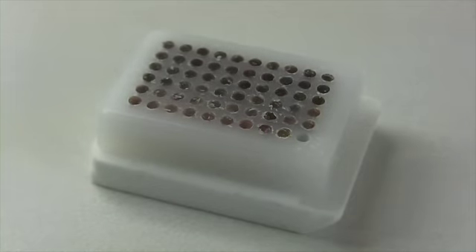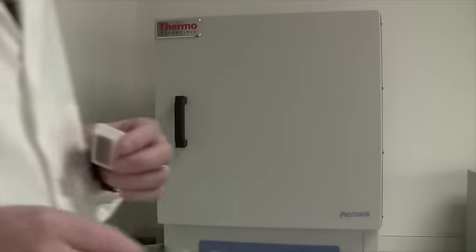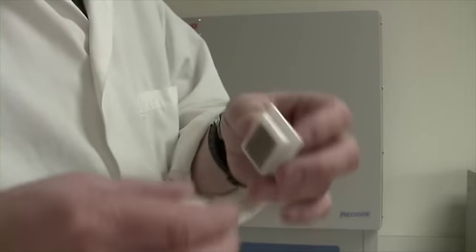Now we can begin to set the punches. Warm an oven to around 43 degrees Celsius. Place the array block on a glass slide face down. It doesn't matter if it's a charged or non-charged slide.